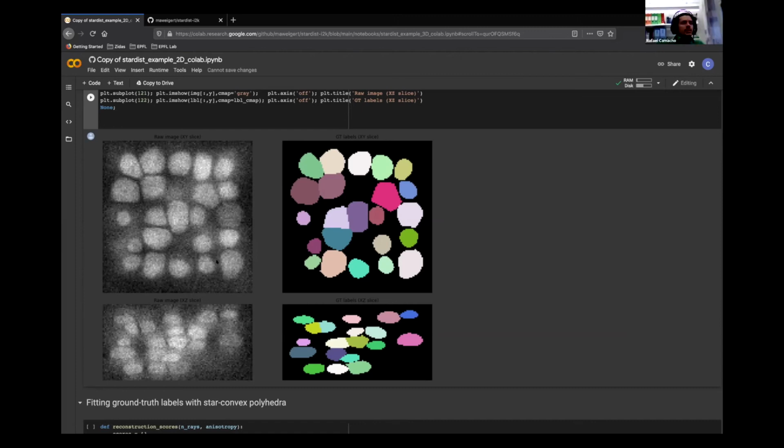Yeah, and when you say that it's inferred, it's because you assume that the volume has to be isotropic, so it should look like spheres, or how do you calculate? No, internally it just uses that to distribute those rays way better than it would if they were spheres, right? Because they're not spheres, they're kind of compressed objects, so it uses that information to distribute those rays better.